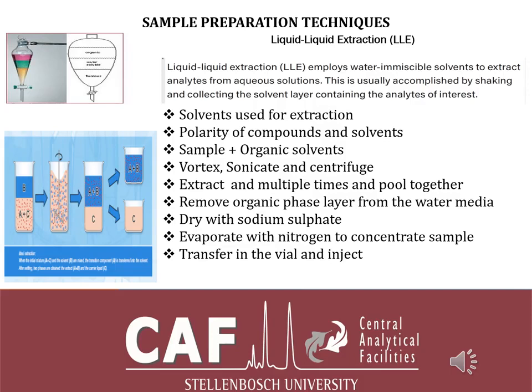It is also important to consider the polarity of your compounds of interest. I always say it is important to match the polarity of your compounds of interest with the polarity of the solvent. If you're working with polar compounds, you obviously have to use a polar solvent to extract them, because if you use a non-polar solvent, you're not going to get the polar compounds into it. It makes sense to consider the polarity.